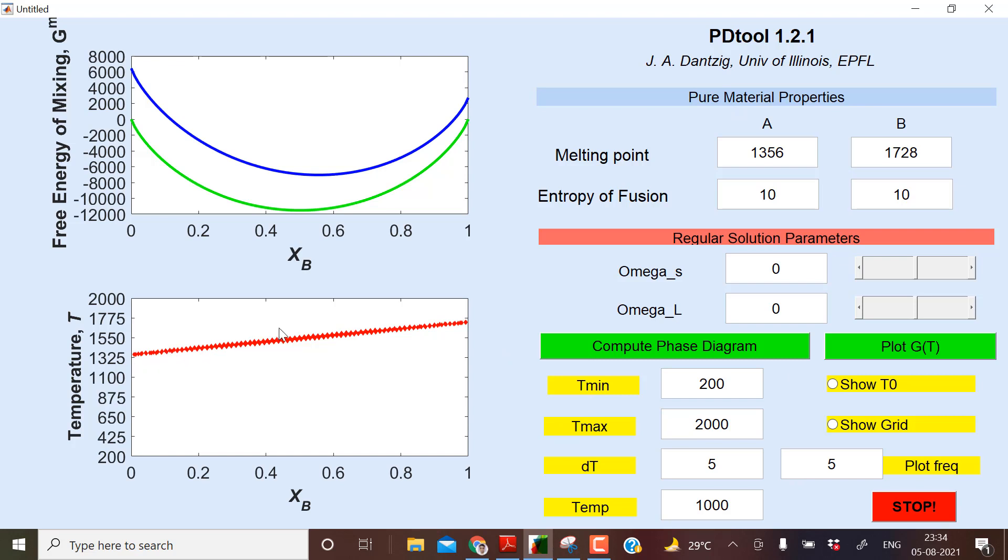So this is what we have drawn at temperature of thousand. Now this red line in the bottom you can see here, the red line in the bottom is being drawn. So that follows a curve like from 1356, so here it mixes from this 1356 to 1700. Then again in the downward also you get a line, so here the two lines are getting merged, that's why we are not able to differentiate very easily.